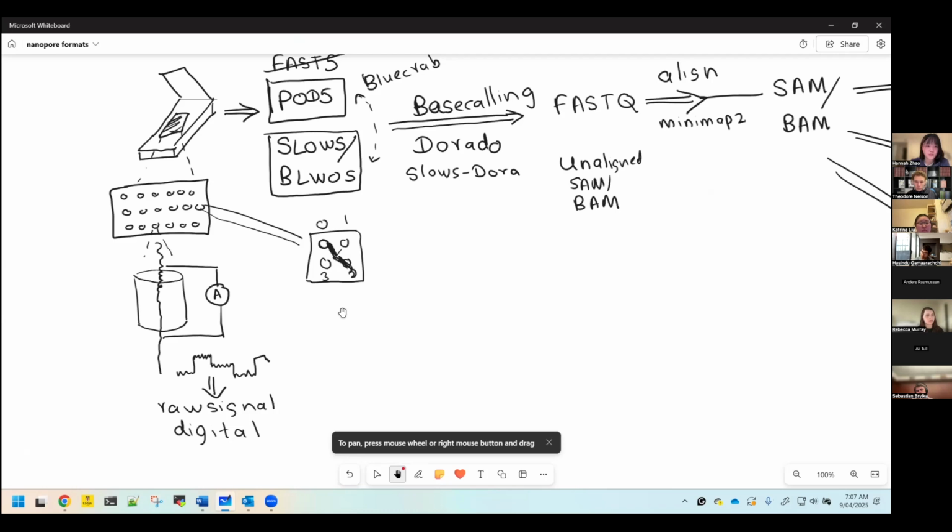Can you give us some insight into how the base caller calculates those quality scores? What is it comparing to? That is done using a neural network. You may know these base callers nowadays use deep neural networks. The most recent ones, like the V5 models, use a transformer model, a very cutting edge neural network model.